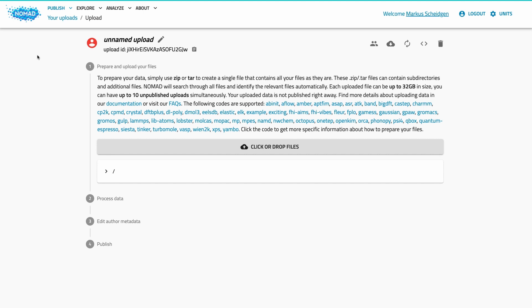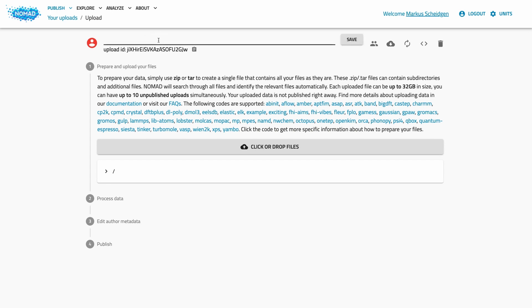Here you can manage this upload, provide files, manage contributors, edit additional metadata, and control the published status of your data. The upload page shows a four-step process that consists of uploading files, processing your data, adding additional metadata, and eventually publishing the upload. Before we go through these steps, let's name our upload. This helps you to organize your uploads and has no further influence on how the data is represented in NOMAD.